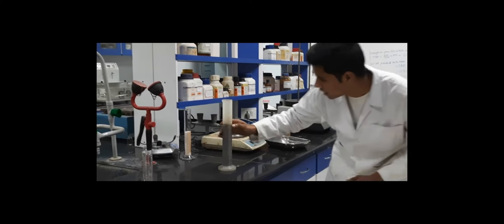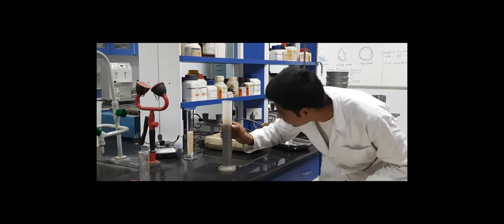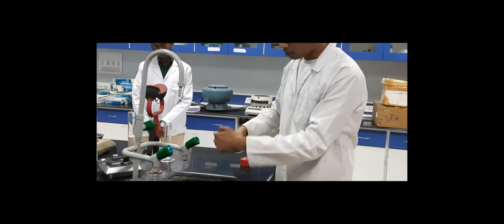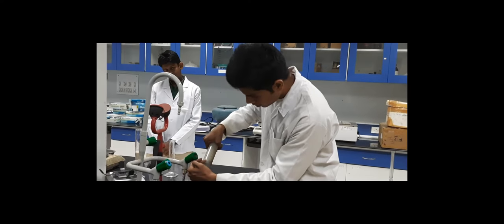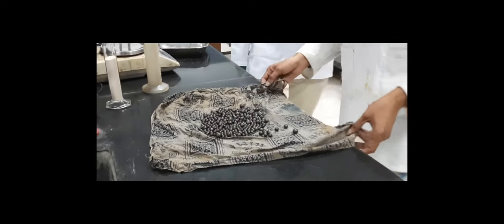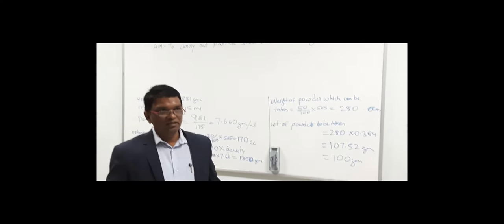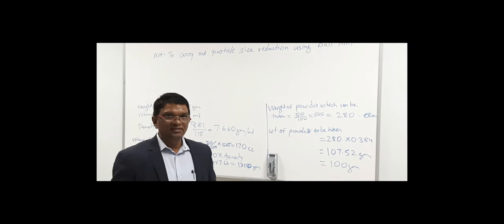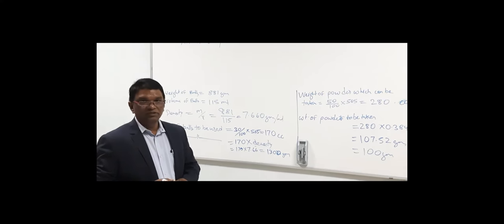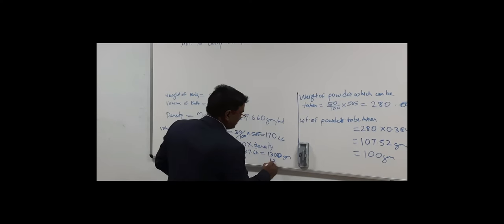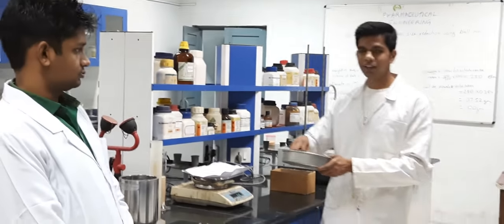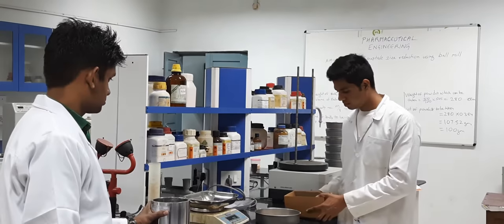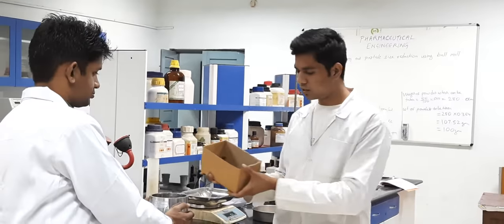The water level raised up to 215 ml, which is the final volume. We will immediately remove the water from the balls and wipe them dry. We have to calculate the quantity of balls to use in the ball mill and determine their density. The quantity of balls to be used in the ball mill is 1.3 kg. We will also take the powder, approximately 100 grams, along with the 1.3 kg balls.